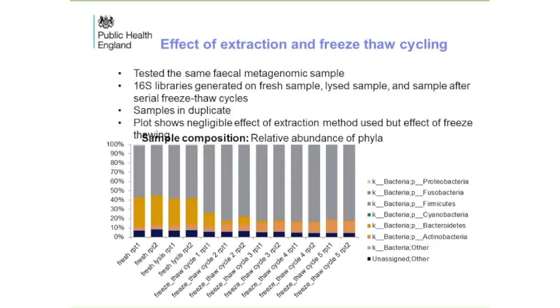So if fecal samples are taken from a patient and these are frozen for further analysis later on, the likelihood is that there will be a shift and a reduction in certain groups of organisms and their recovery upon whatever methodology or whatever lysis process you undertake following transfer of these samples. So the question that raises a variation here is, should the samples be lysed immediately after they are collected while they are fresh, or if they are going to be frozen, be aware what organisms might be lost.